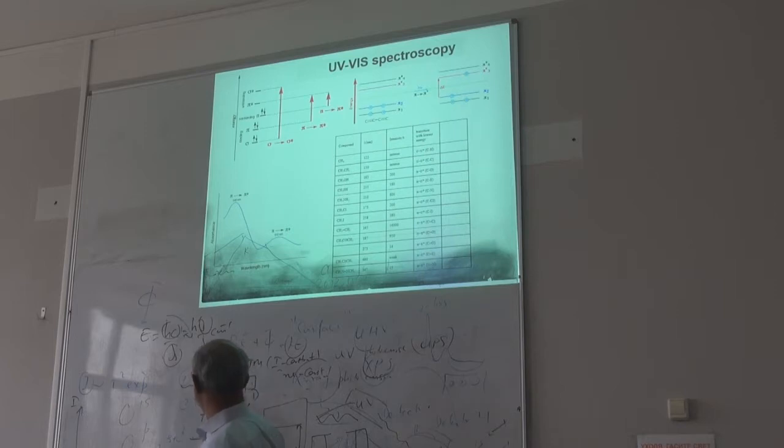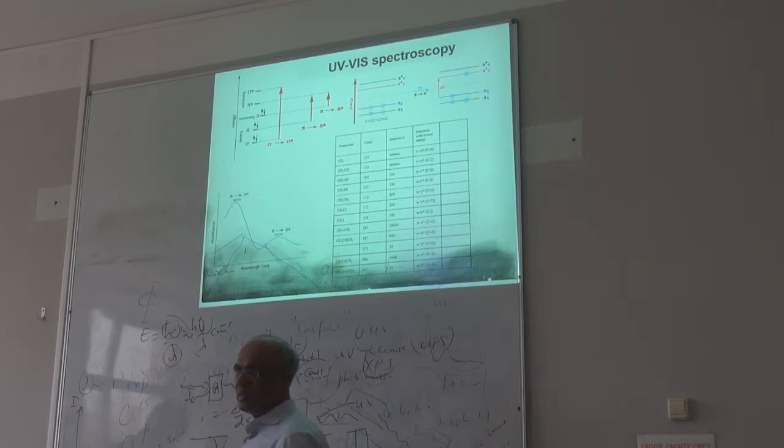We know your incoming light is equal to the transmitted plus the reflected plus any absorption. The absorption is what we need. So if you measure T, you can get information about your absorption. But if your sample is a solid material like this, light cannot go through. Then we use something called diffuse scattering, a reflective measurement.